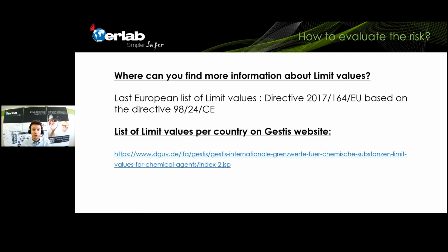For your information as well, where can you find more information about limit values? There is a European list, and for countries that are not European, of course, it's important to have a look at what your country says for each product. Keep in mind, when you do a risk assessment in the lab, this is a really good way to check the danger of a chemical. However, you don't want to be exposed to any chemical vapor. So minimizing the risk in any possible way is always recommended.